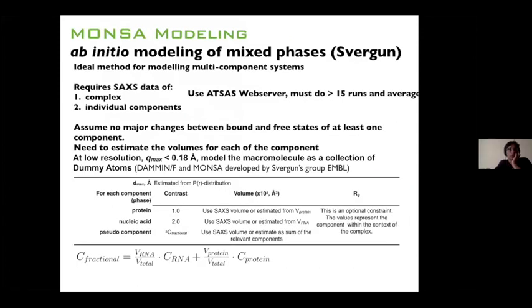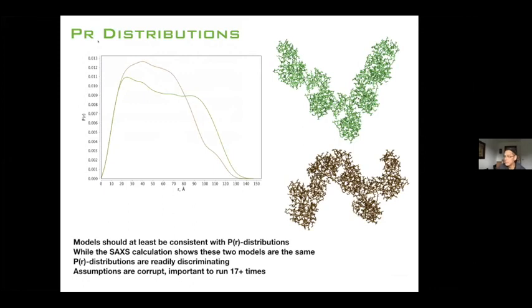Okay. Can we interrupt you? Yeah, go ahead. So I have a question. This is exactly the problem that our users and everybody in the SAXS field need to know. When you calculate a SAXS curve using a SAXS calculator from the atomic structure that you show, they are also very different. So it's not only the problem that the homogeneous beads or homogeneous body calculated SAXS profile is equal. The information and constraints from the atomic structure are different, and the calculation of those profiles is different using a SAXS calculator with atomic structures. And they need to be kept in mind too. Ab initio shape, yeah, absolutely. And calculators.